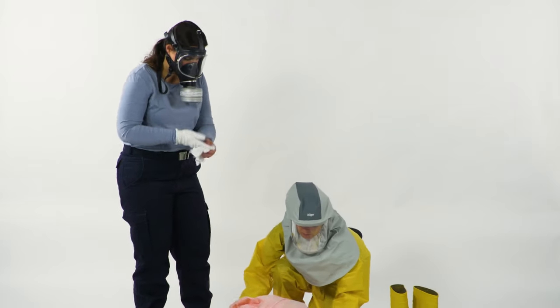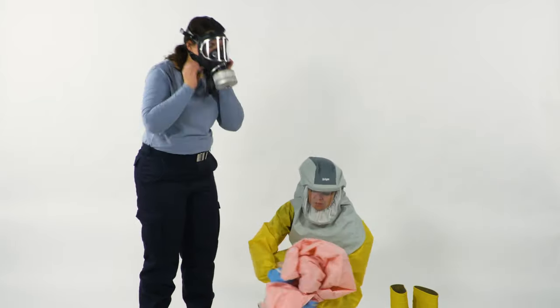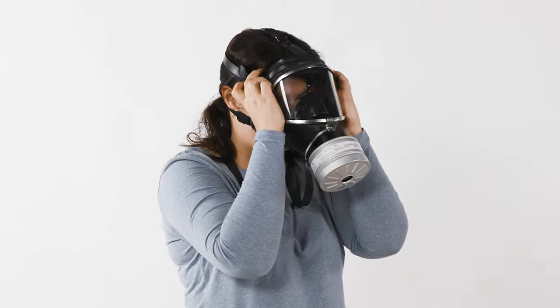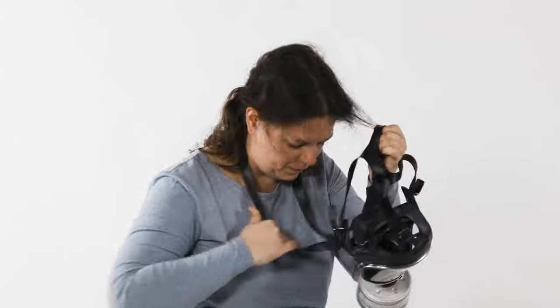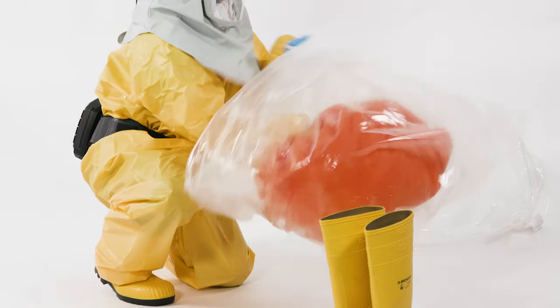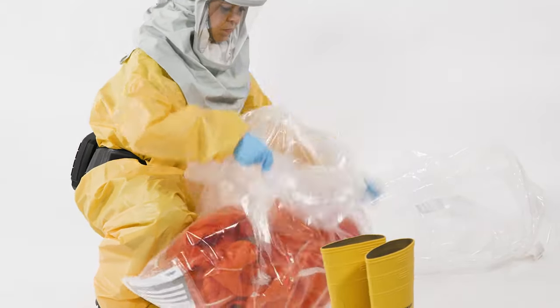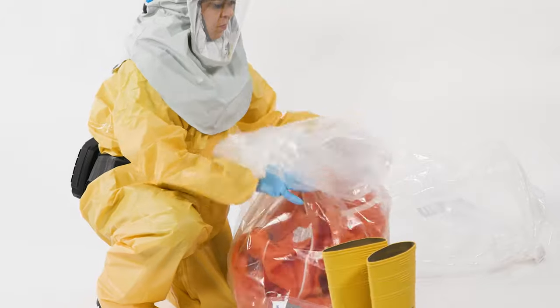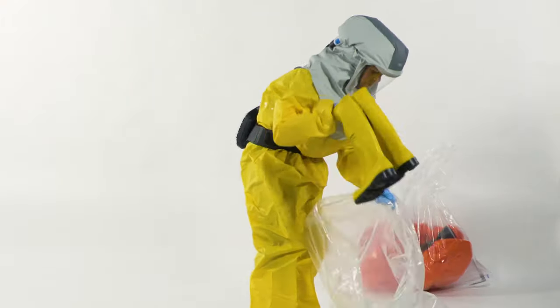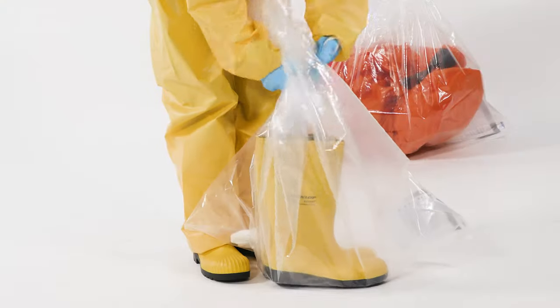Take off the gloves. Then take off your breathing protection. Turn the suit inside out so that the contaminated side is inside. Put the suit with the gloves into a foil bag and close it. Put the boots in a plastic bag as well.